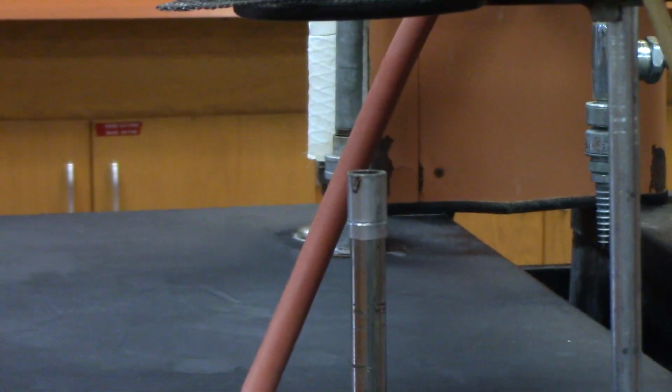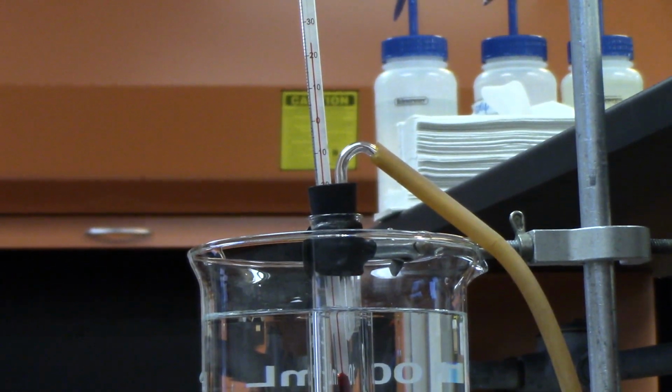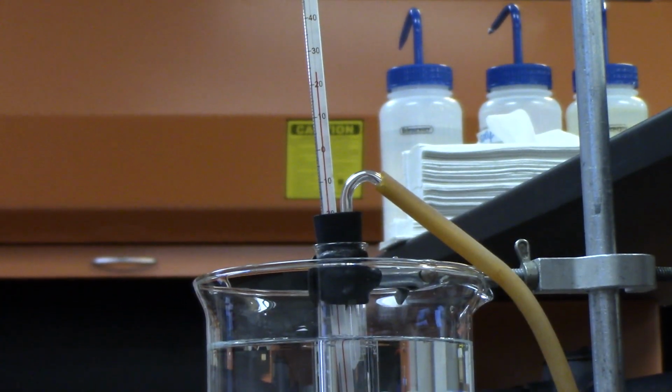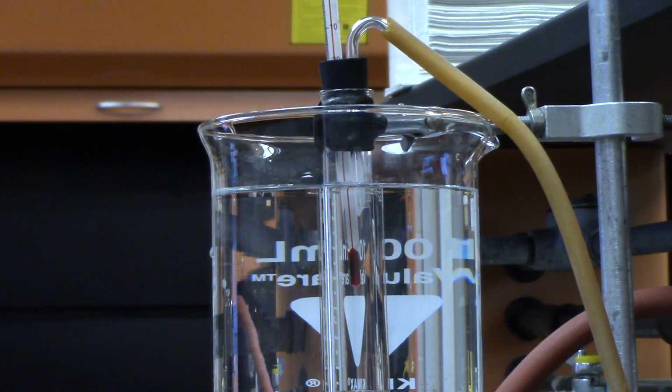There's a Bunsen burner, and I'm going to light that in a second. And then, okay, so what we're going to do is light the Bunsen burner, and as we light the Bunsen burner, it's going to heat up the water, and the water's temperature is going to go up.